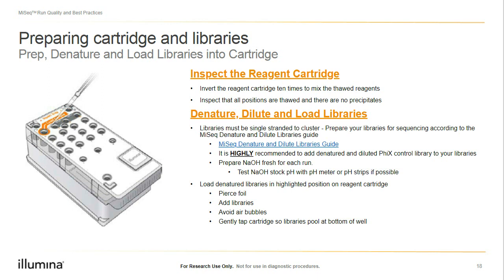This will prevent us from aspirating any air into the system when we're applying our library template, and it'll also ensure that we have sufficient volume of our libraries to aspirate instead of, say, having everything stuck on the side of the well, and when we go to aspirate, we won't have sufficient volume.